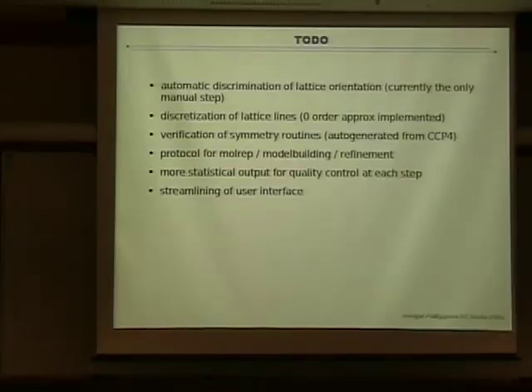And one of the reasons that I'm here, I'm very interested in this thing, obviously. What's the protocol when we're done? How do we easily go into the X-ray molecular replacement, model building, refinement? Now, we're not going to code that, obviously, but it's to establish the protocol and the procedure for how to easily go there. And that's for us, which software to set up, to discuss with the experts here how to get that easily done. But that's also something that needs to be done for us.